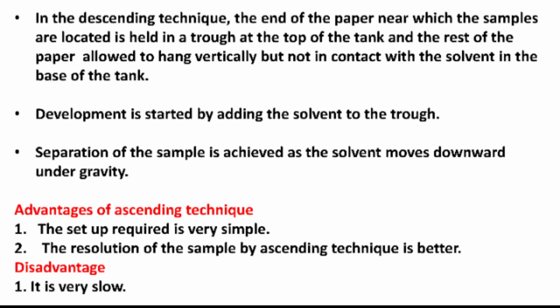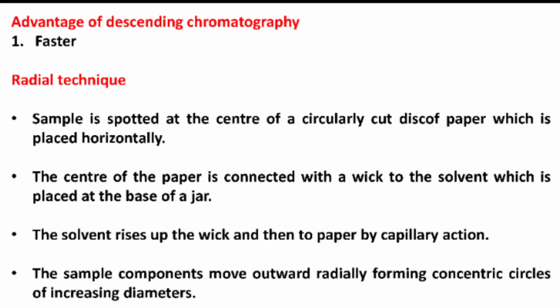Advantages of the ascending technique: the setup required is very simple, and the resolution of the sample is better. The disadvantage is that it is very slow. Advantage of descending chromatography: it is much faster.